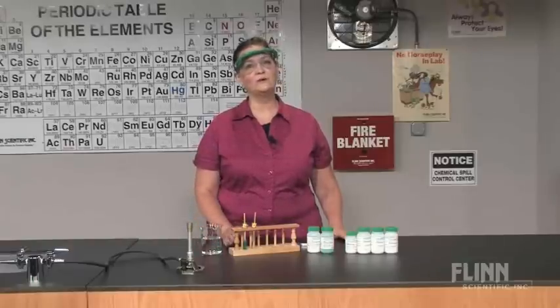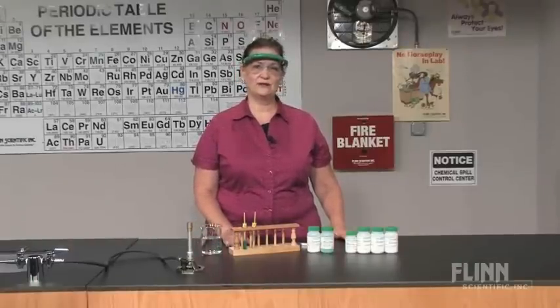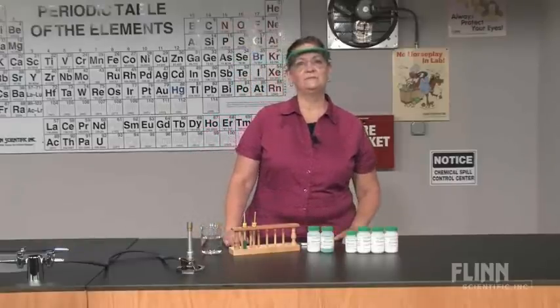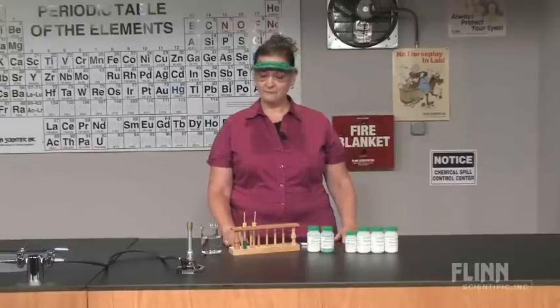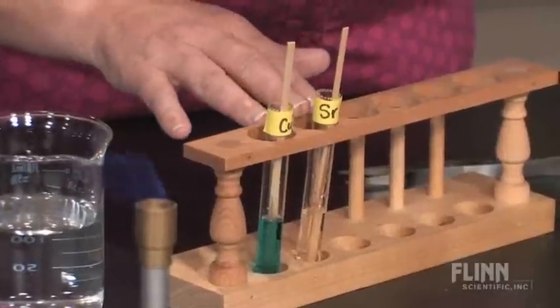First, you'll need some 1 molar solutions of some metal salts. The concentration is not critical and 0.5 molar would work just as well. We have found that metal chloride solutions are easy to work with and produce great results. Here I have 1 molar solutions of copper chloride and strontium chloride.